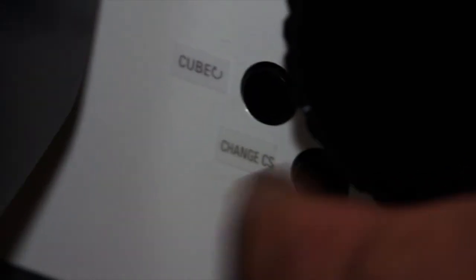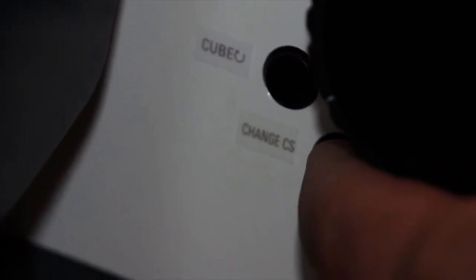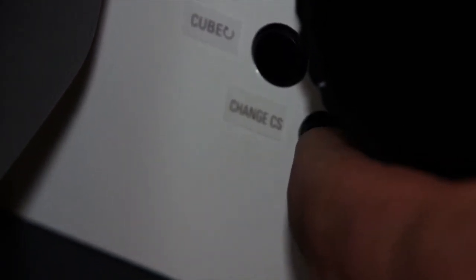Finally, the bottom button is very important because the bottom button allows you to switch between observation in the microscope and sending the image over to the computer. So when you push the bottom button, it sends the image to the computer for scan mode. You can also go from scan mode back to direct observation through the microscope by pushing that bottom button.